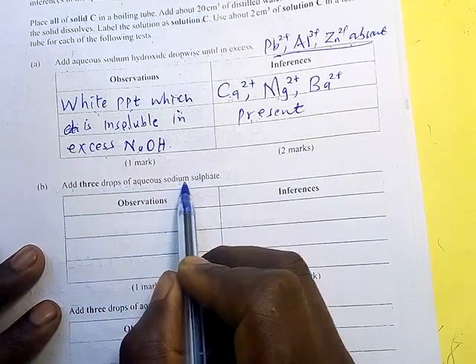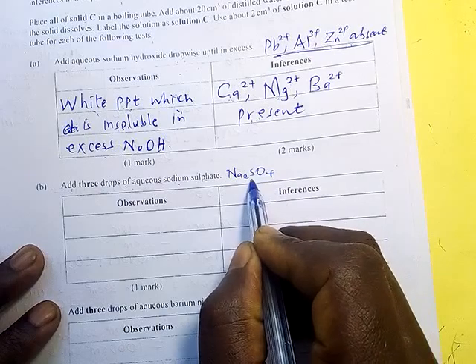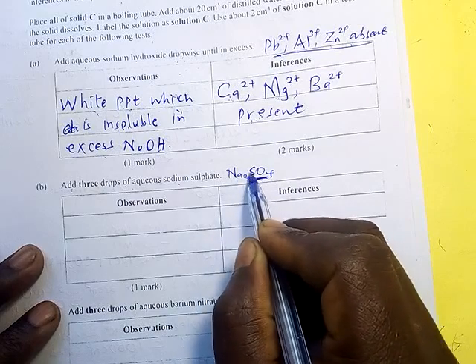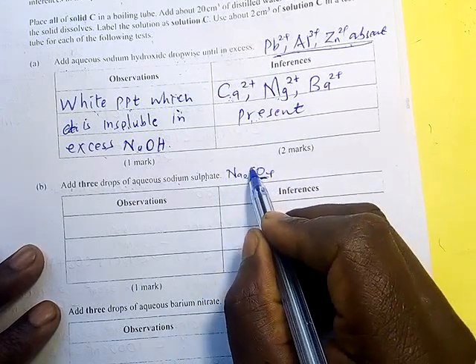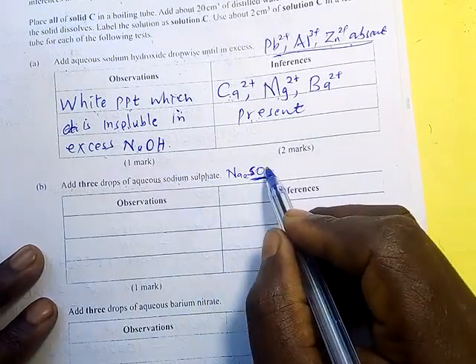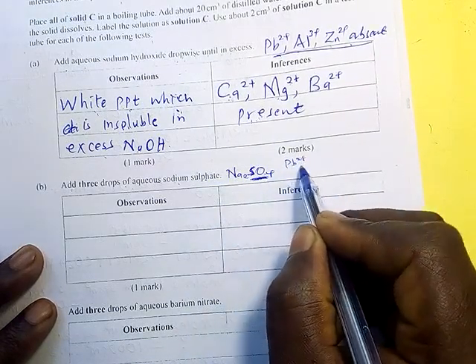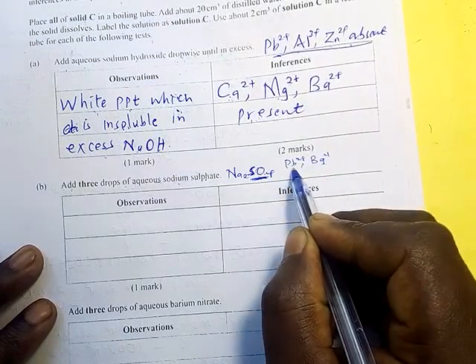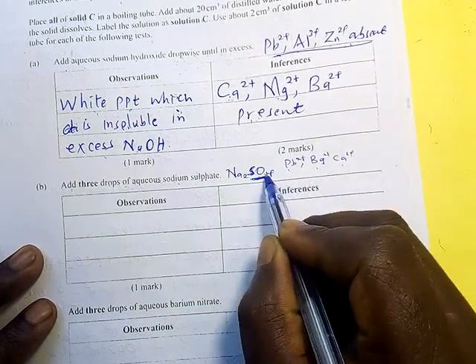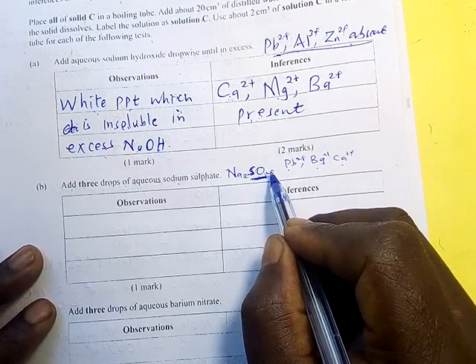Add 3 drops of aqueous sodium sulfate. We are adding sodium sulfate. So you are seeing the sulfate. Here we expect, because remember all salts of sodium are soluble, that if this gets into that solution in our test tube and finds lead 2 ions, it will form a white precipitate. If it finds barium, it will form a white precipitate. If it finds calcium, it will form a white precipitate, the sulfate. We know salts of sulfate which are insoluble form white precipitate.